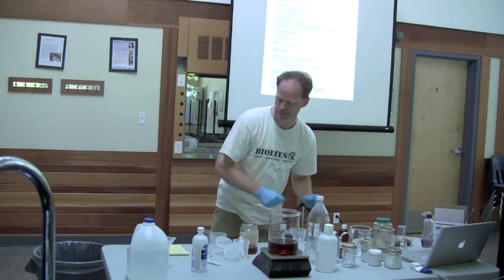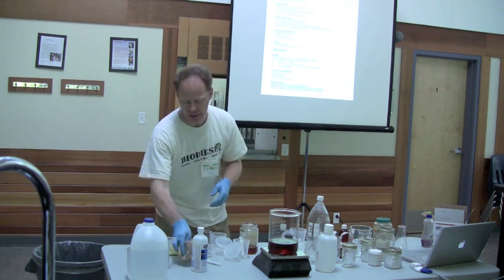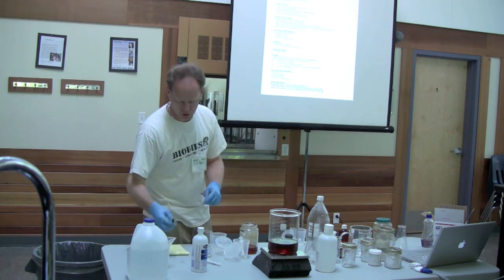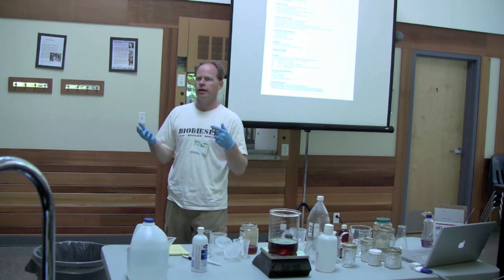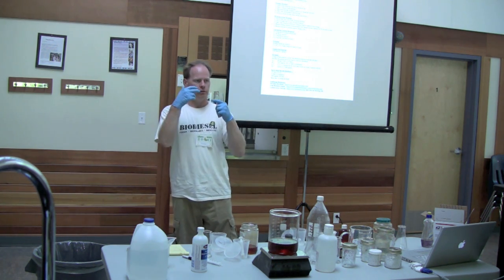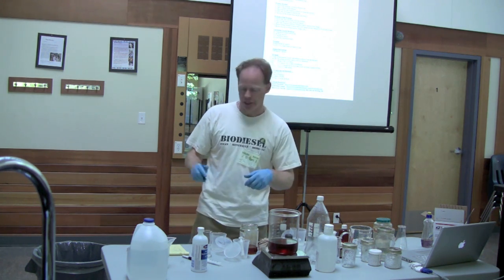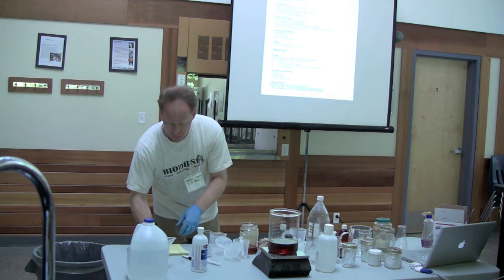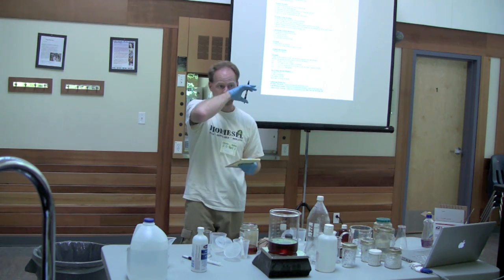Okay, so that's titration. Now how do we take the titration and make biodiesel out of it? Well, remember, titration said that number was, we're going to go with a 4. So it took 4 milliliters of titration. Well, what do we say? 4 and 2, half will come in the middle, we'll go to 3. So it took 3 milliliters of titration solution to neutralize this. Let's talk about the recipe and how we calculate this.